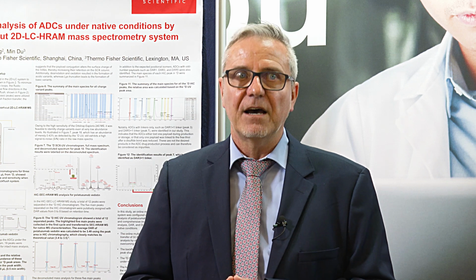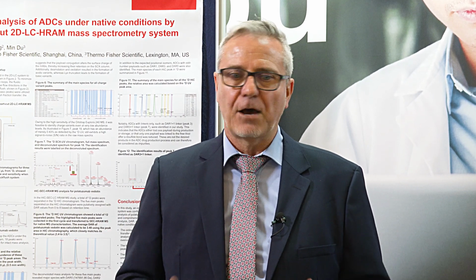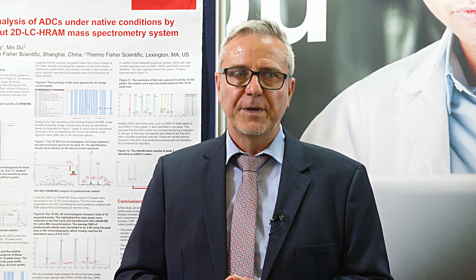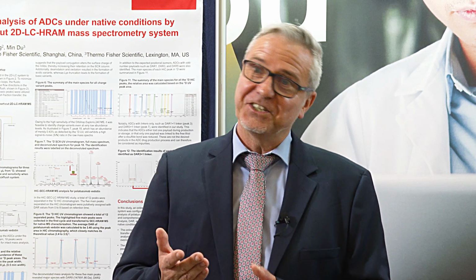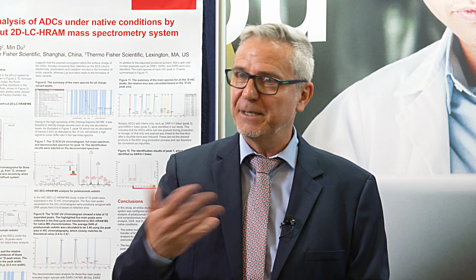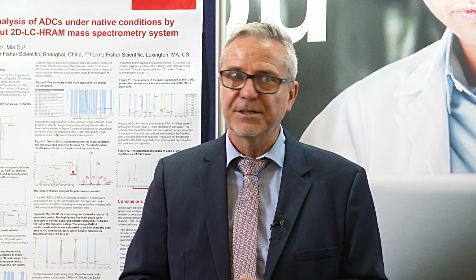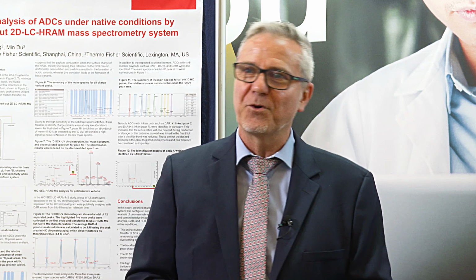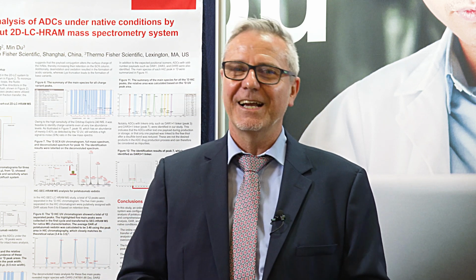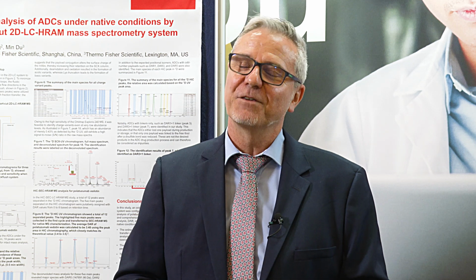And at the same time, somebody looking at our results will be aware of where the challenges are when you transfer such fractions into an SEC. So the little tips and tricks, how you combine the dimensions, the diameters of the column, and how you do the transfer. Nobody else has to run into the same issues. They will see it from our results.